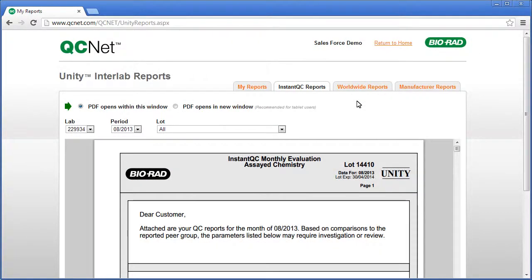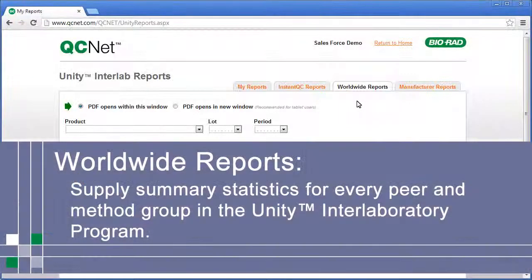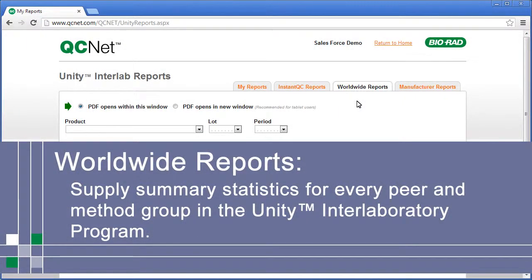Worldwide Reports supply summary statistics for every peer and method group in the Unity Interlaboratory Program. Many customers find this helpful when switching to a new control or lot.